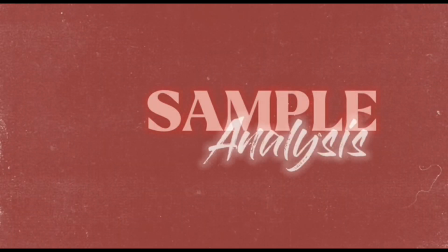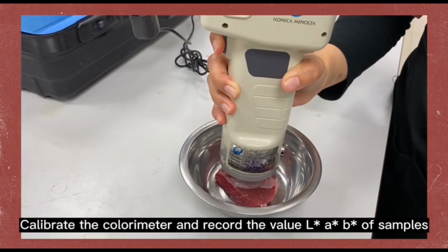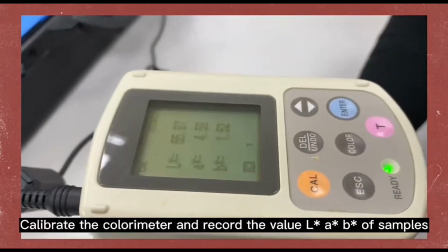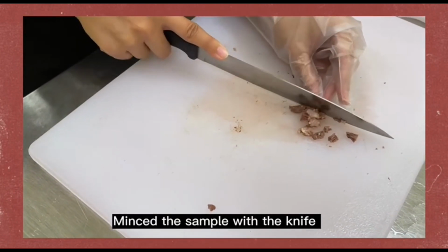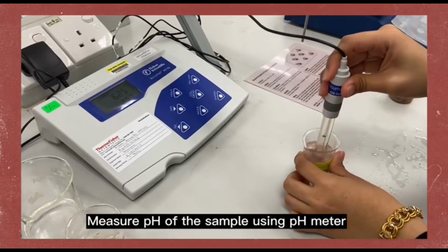Sample analysis. Color determination. Calibrate the colorimeter and record the L, a, and b values of the samples. pH analysis. Mince the sample with a knife. Measure the pH of the sample using a pH meter.